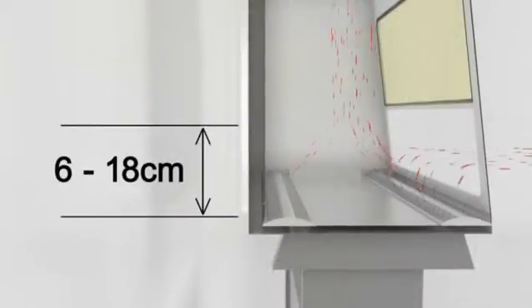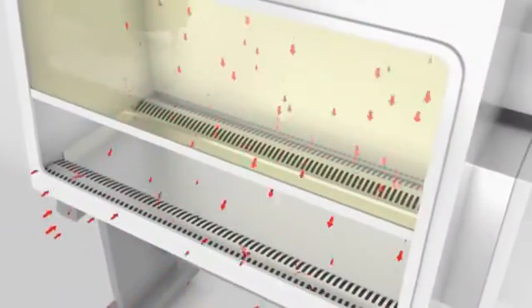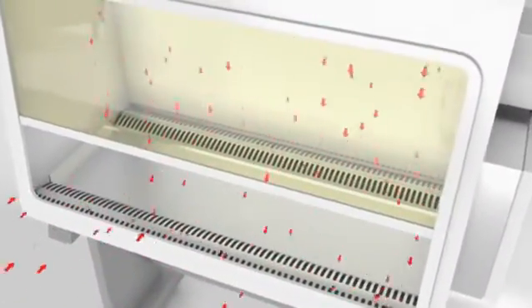This downward flow splits about 6 to 18 centimetres from the work surface. One half of the air passing through the front exhaust grill and the other half passing through the rear exhaust grill.